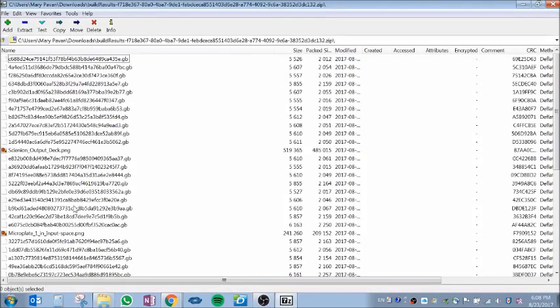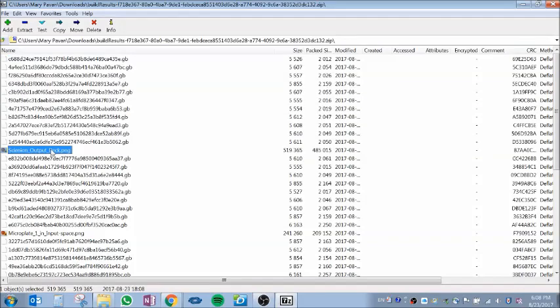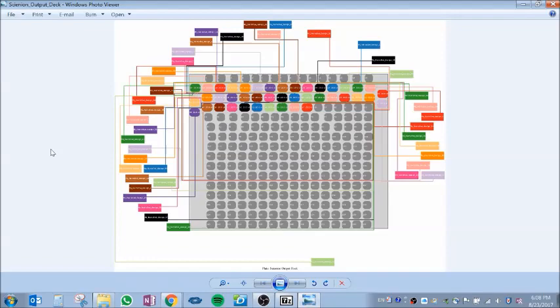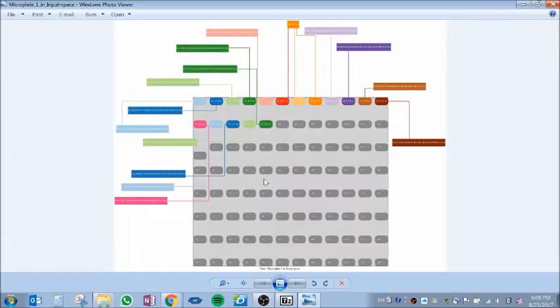The program has just created GenBank files for all the designs. Visual instructions for the input plates. It contains the parts and volume needed for each part.